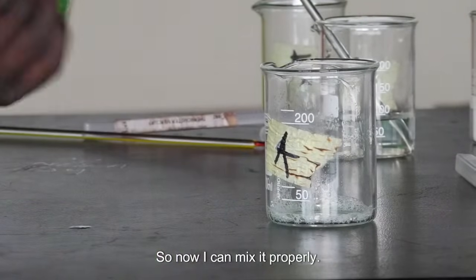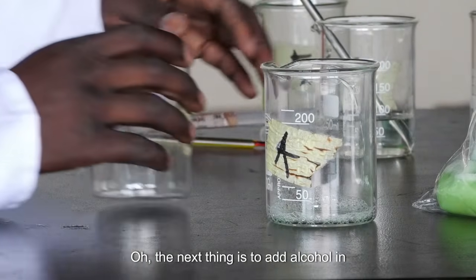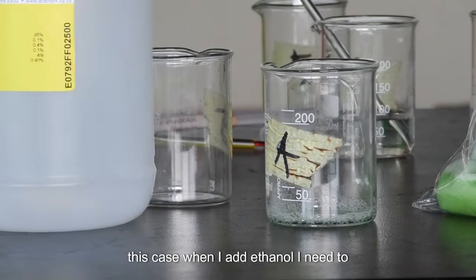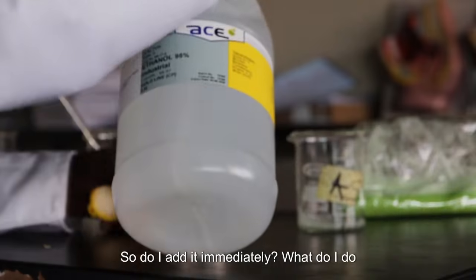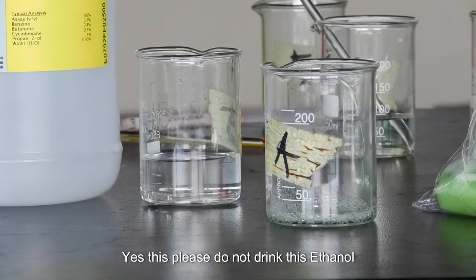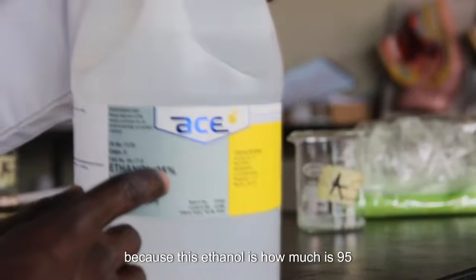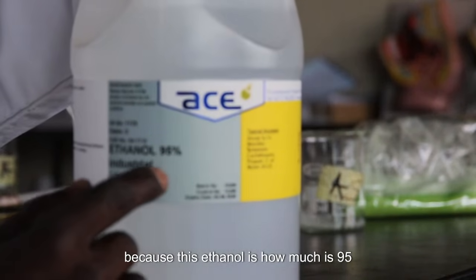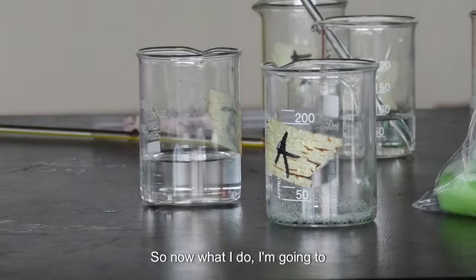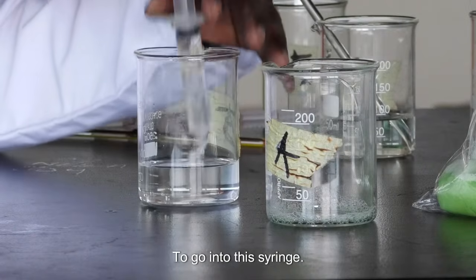Now I can mix it properly. Now the next thing is to add alcohol or ethanol. When I add ethanol, do I add it immediately? What do I do? This ethanol needs to be cooled down. Please do not drink this ethanol, because this ethanol is 95%. So now I'm going to put this ethanol into this syringe.